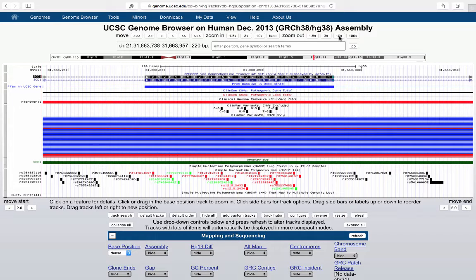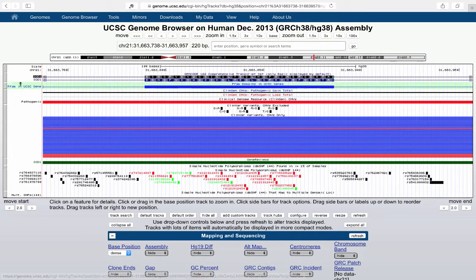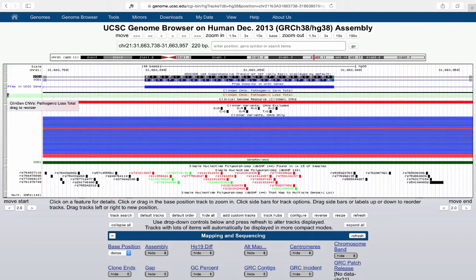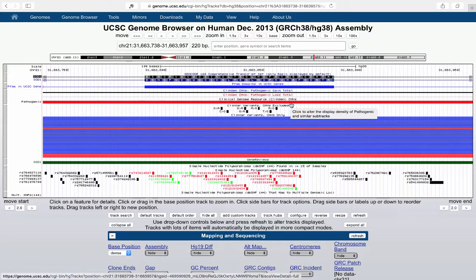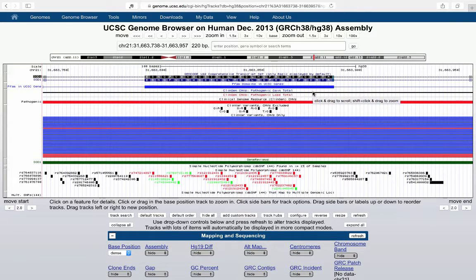Note that in the Gencode track you can actually see the amino acid codes. Now I want to draw your attention to the ClinGen CNVs track. These are clinically associated, experimentally verified by microarray, copy number variations. Red represents a pathogenic loss, so this particular CNV covering this area is a pathogenic loss. There are also likely pathogenic, unknown, likely benign, and benign categories, each with different colors, and you can click through to learn more.